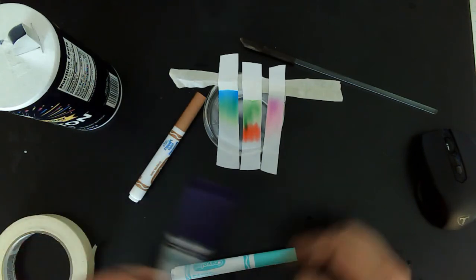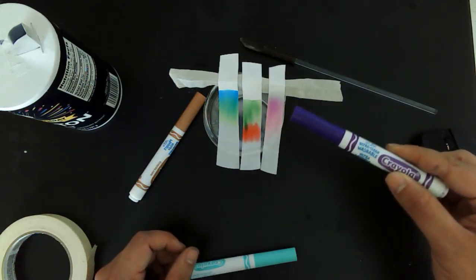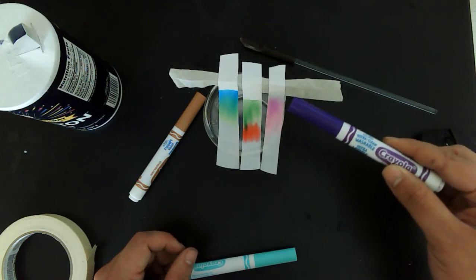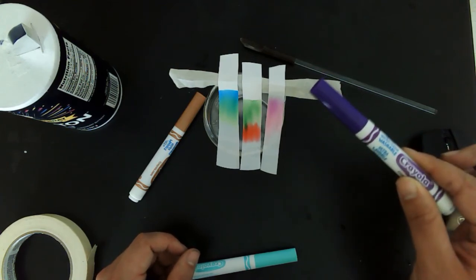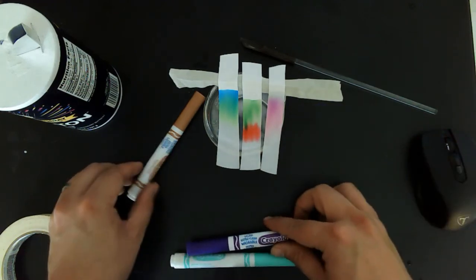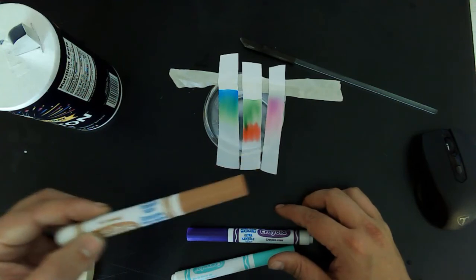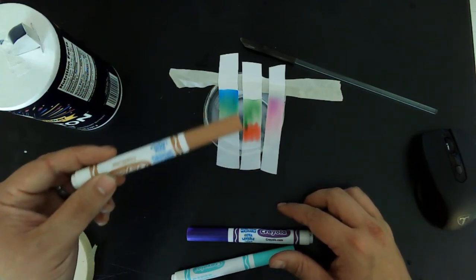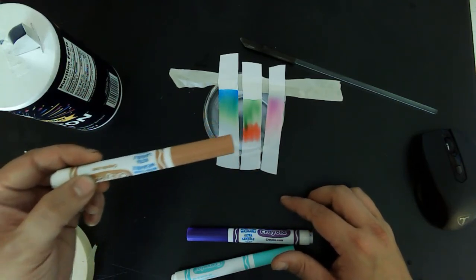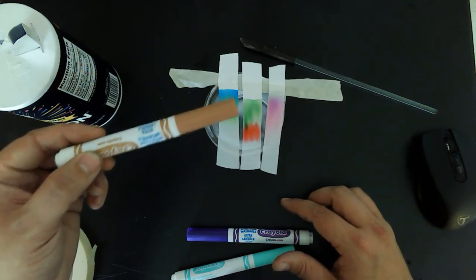What do we notice about purple? Purple is over here and has a little bit of pink and looks like just some more purple. To make this a nice dark purple, it looks like a mixture of two different pigments. My favorite one, however, is the brown. Brown looks like a mixture of a bunch of different colors. We see a lot of red, a little bit of blue, some greens, and some yellows.